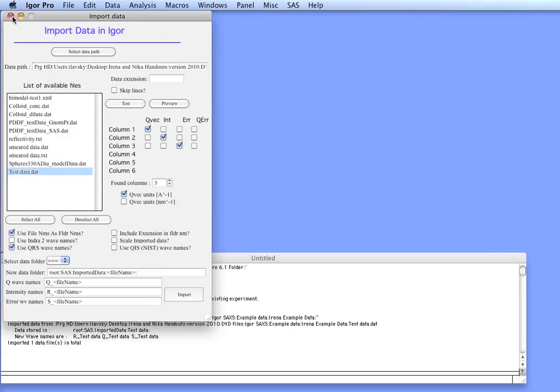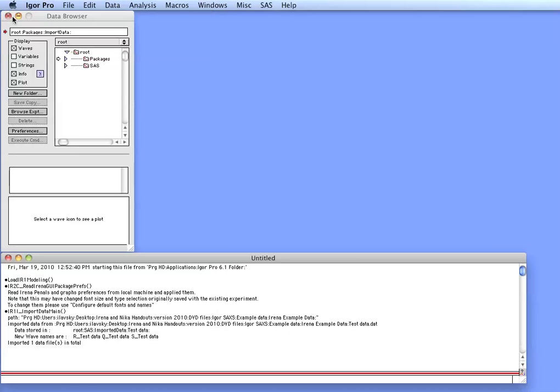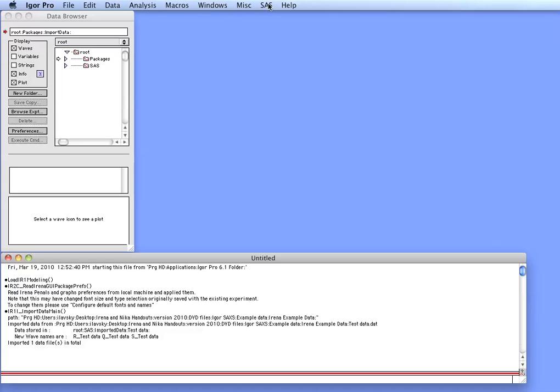These test data are actually a mixture of fine and coarse alumina polishing powders which we measured in 2001 using the USAXS instrument. Unfortunately, these data cannot be absolutely calibrated so the results would be on a relative scale with respect to volumes. But other than that, this provides a very useful data set for analysis.